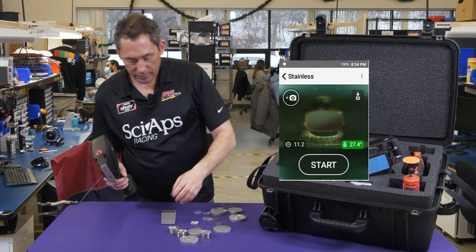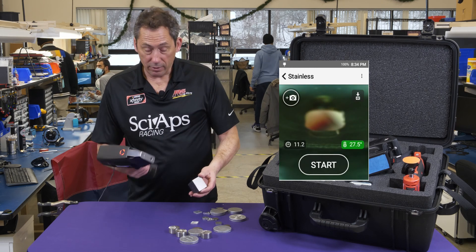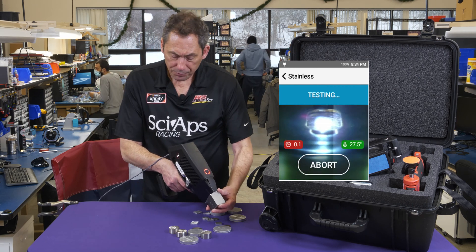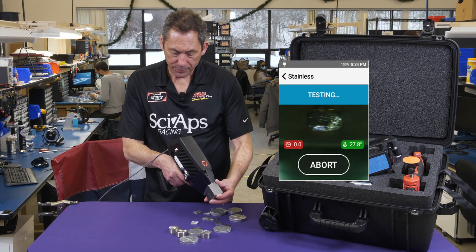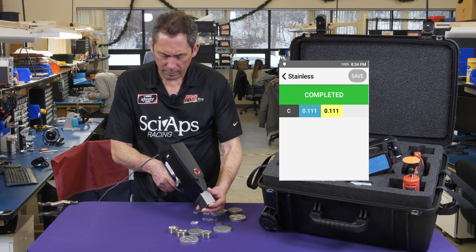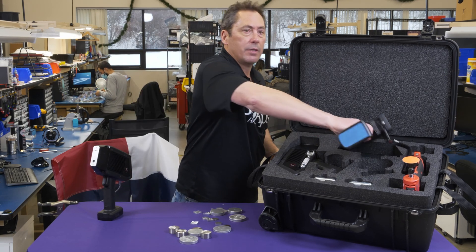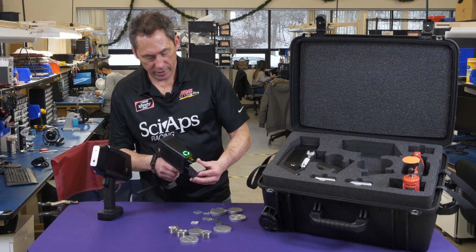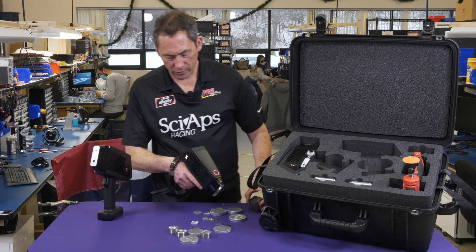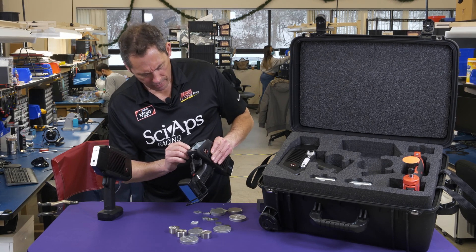For example, let me show you how it works. Take a piece of X42 pipeline steel — take the LIBS, put it up there, pull the trigger. It does a pre-burn, then it comes up with its carbon result: about 0.11% carbon. Now you take your XRF and shoot it — in a couple of seconds you get your result. This one shows you your vanadium, chromium, manganese, nickel, and copper — all the elements.